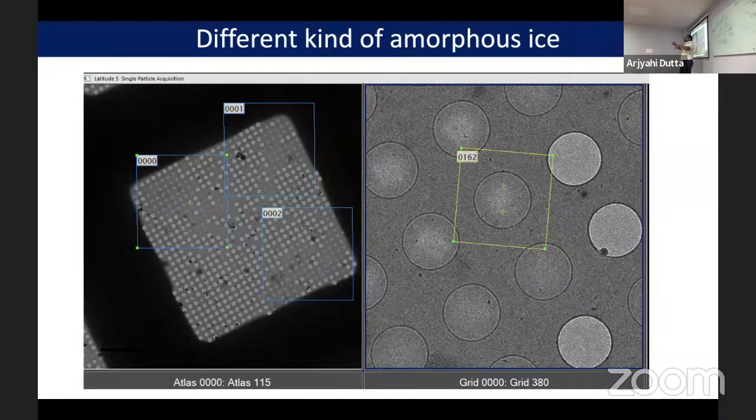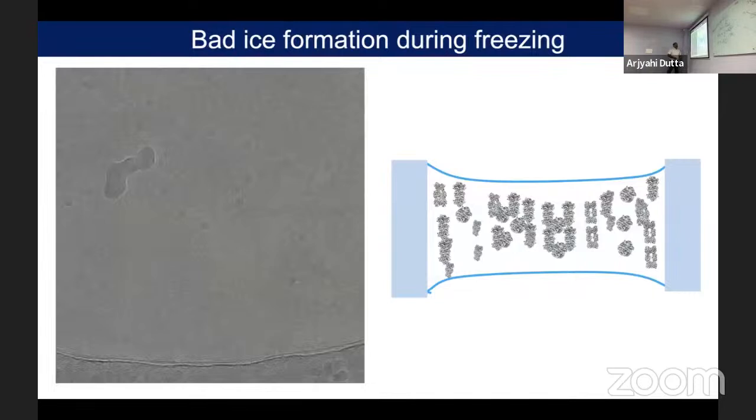So we should not say spot size, because the same spot size is used for condenser lens 1. The spot size helps us to determine how much electron dose is coming. So here we can say what the beam diameter is. Generally, you can consider 1.6 or 1.62 micrometer as the beam diameter. So it should not expose the entire hole either. Okay, so that is the condition. If you keep an 8-second exposure and 40 electron dose per angstrom square, that will be good enough. If you stay longer, 10 seconds or 12 seconds, it will start melting, but it also depends on the ice thickness. That is why I'm going to come to the next one.